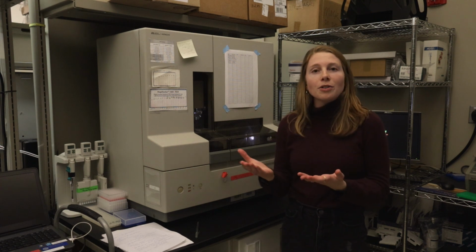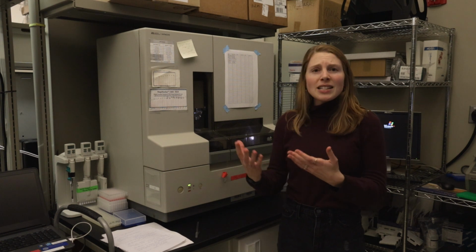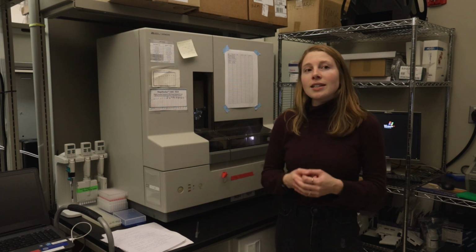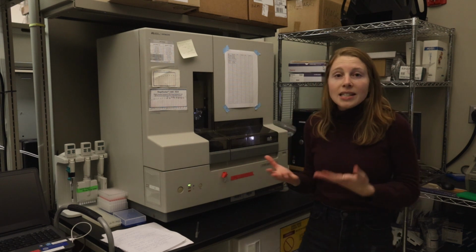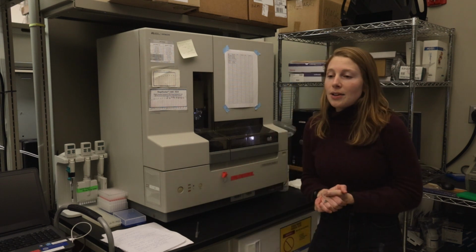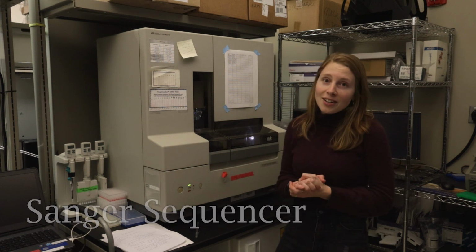She just talked about PCR and how we use that approach kind of as a copy machine to increase the numbers of DNA fragments. And so the next big step is then to sequence that DNA. And so there's many different sequencing technologies. One of them is the Sanger sequencer.